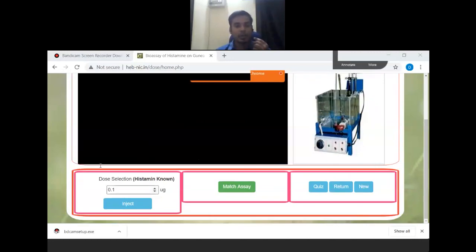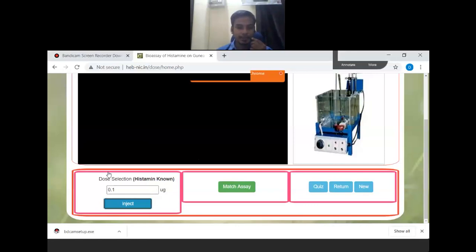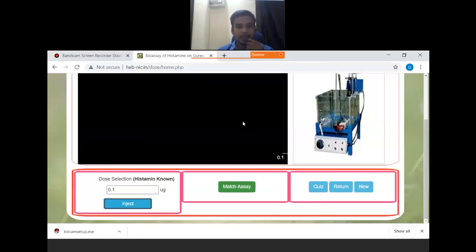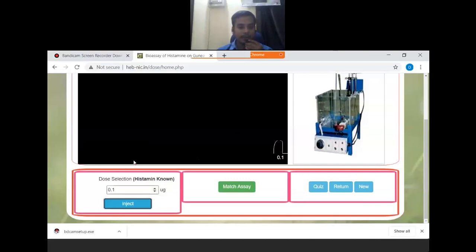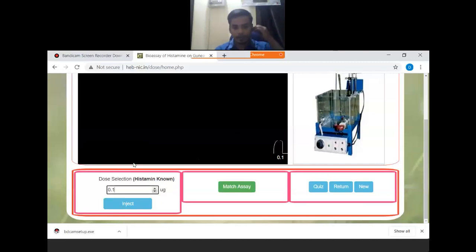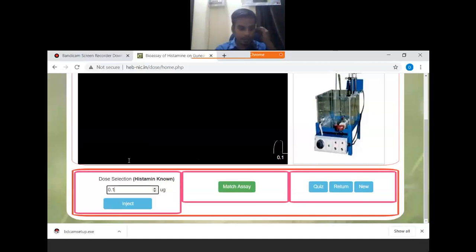So here for 0.1, this is the response that has been found. Next, we will double the dose, this is 0.2.